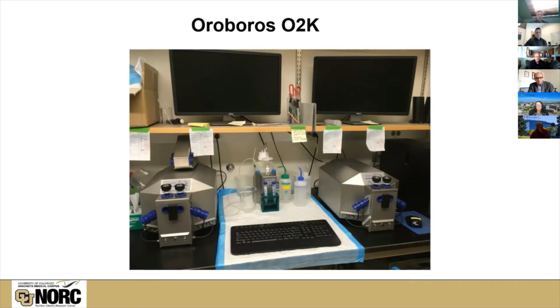We have colleagues in North Carolina that will not use the system for another 7 days after cleaning it with 100% ethanol. We've lost a lot of data because people were not cleaning the instrument as well as they should have. And you don't know it until the end of that 6-hour period. That's the kicker. Everything looks like it's going well. You get to the end and you're like, oh my God, this was horrible.